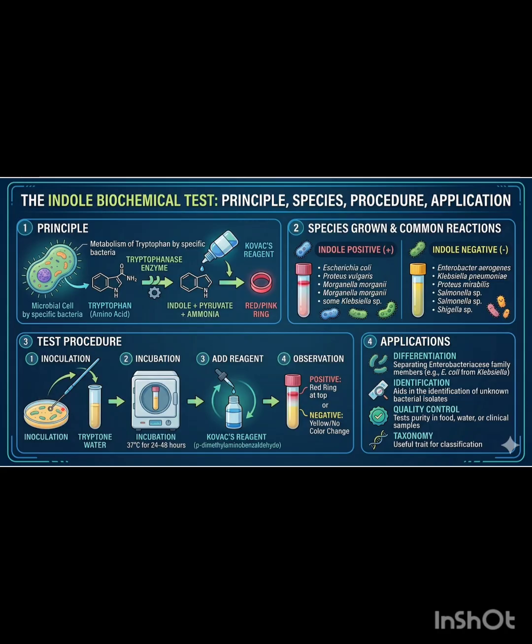Okay, first we will be heating this needle for sterilization, and only then will we take this species and do the inoculation. After inoculation, we are going to incubate the tube. For incubation, we are going to do it at 37 degrees Celsius for 24 to 48 hours.